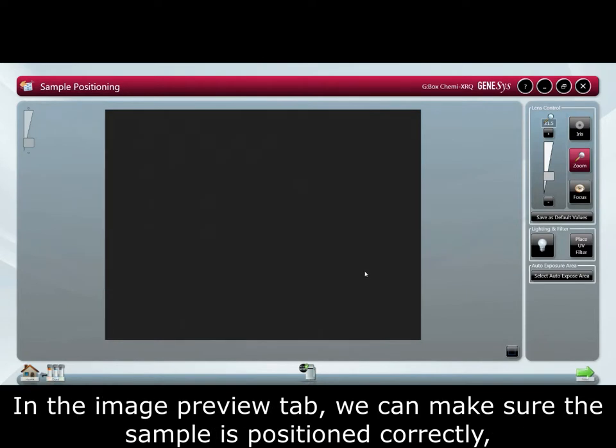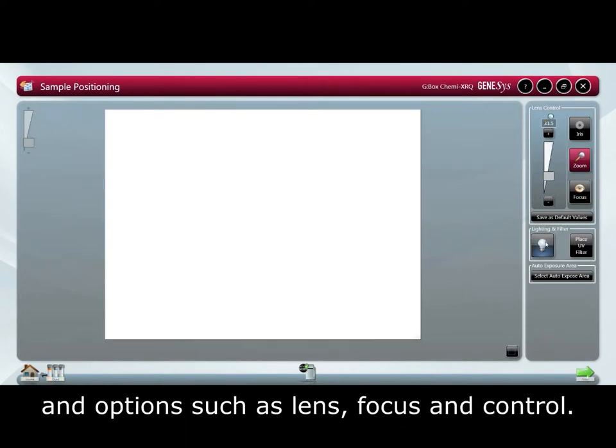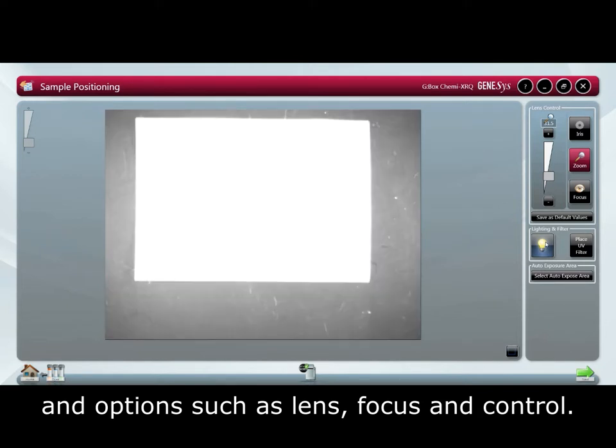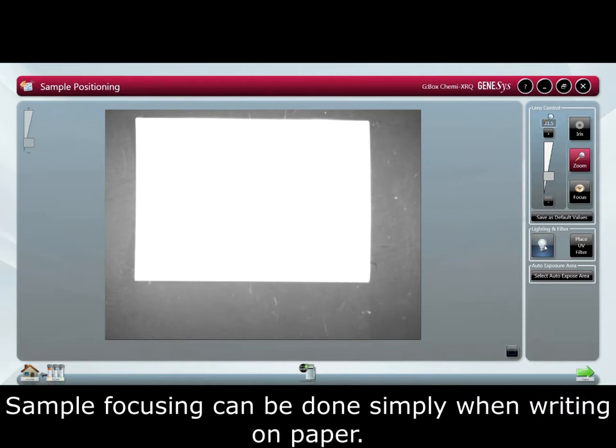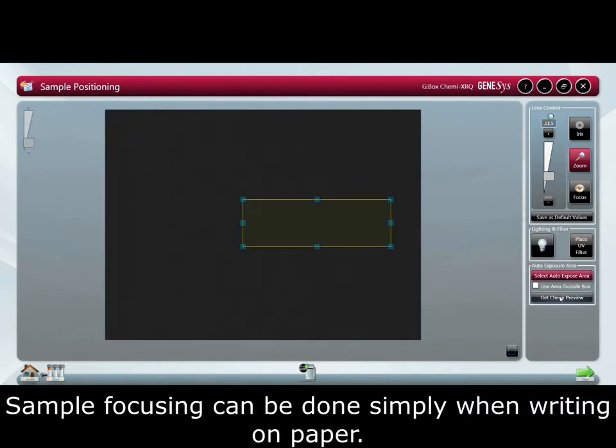In the image preview tab we can make sure the sample is positioned correctly and options such as lens focus and control. Sample positioning can be done with upper white lights or simply the door slightly open. Sample focusing can be done simply with writing on paper.